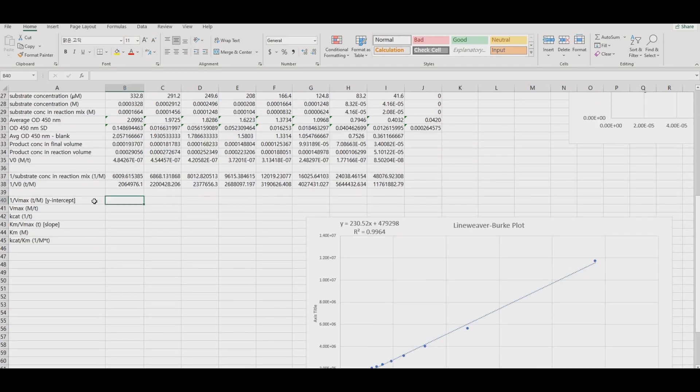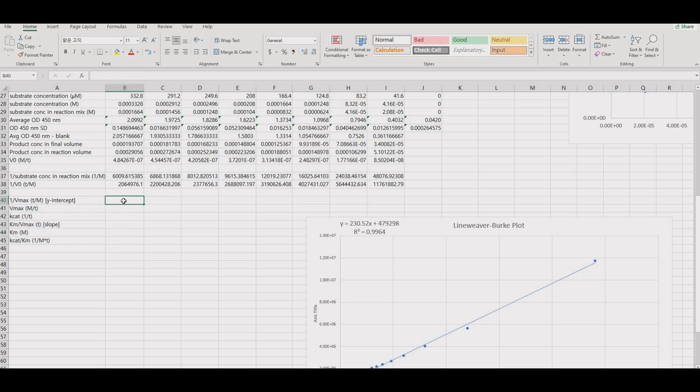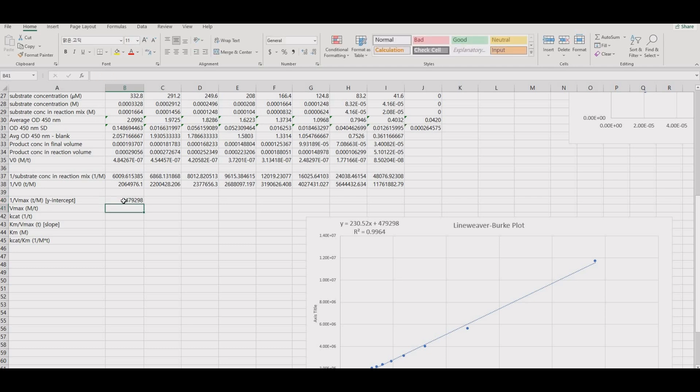Use the constants from the trendline equation to calculate the Vmax, Kcat, Km, and Kcat over Km. The y-intercept is 1 over Vmax, and so calculate Vmax accordingly.